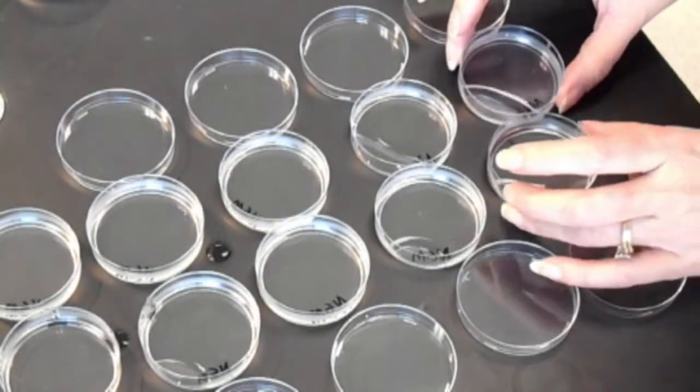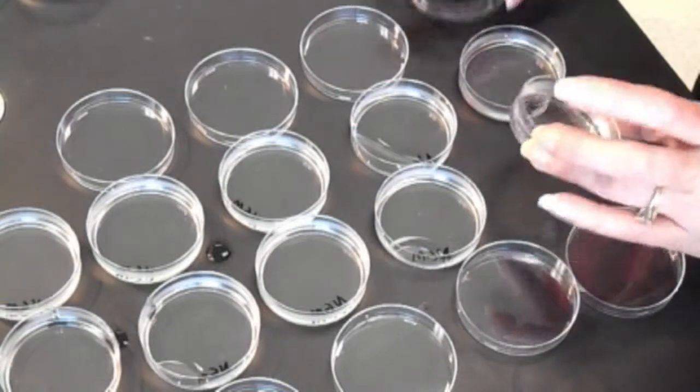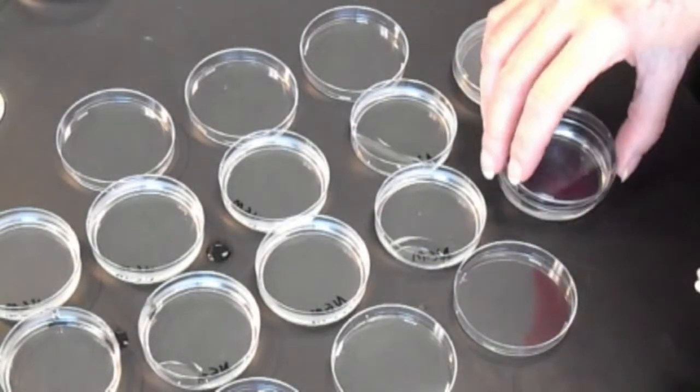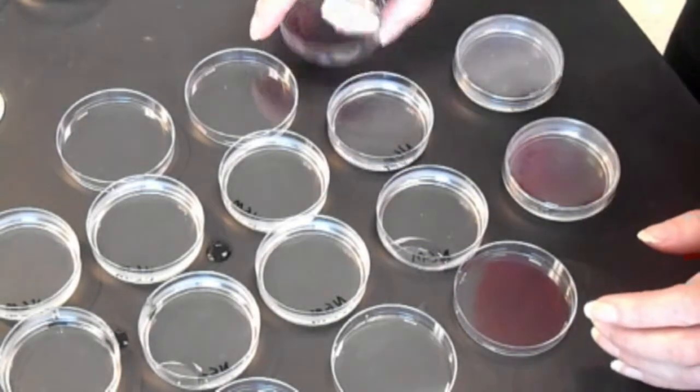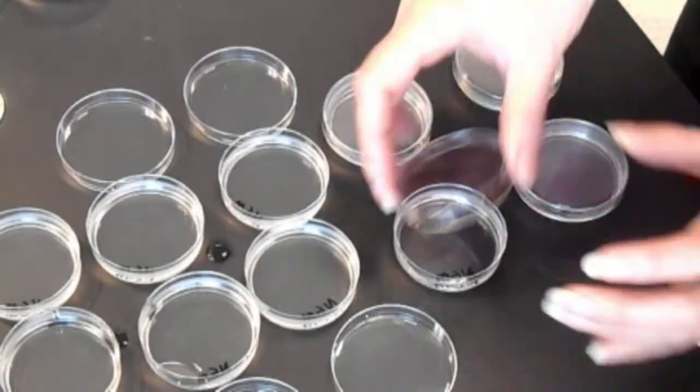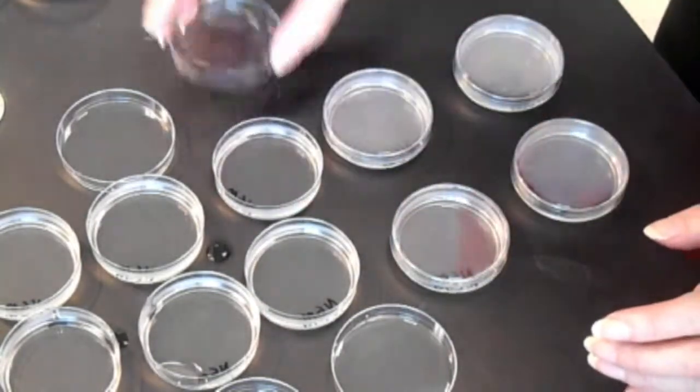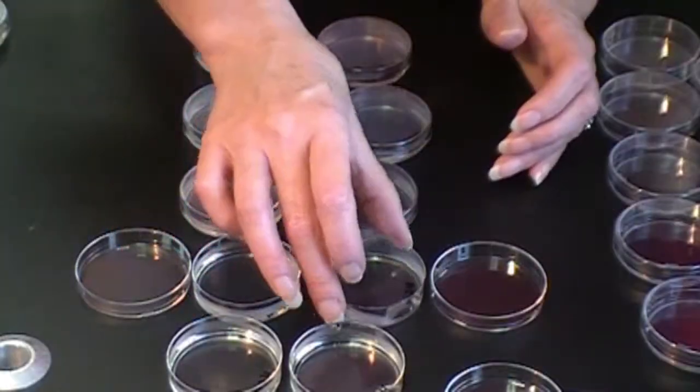And then I just give them a little swirl to make sure the bottom of the plate is coated. Pop the lid back on. Remember, we're working in a sterile environment as far as we can control. We've cleaned the lab benches off with our alcohol mixture. And then we just cover the plates as quickly as possible. And let them set up.